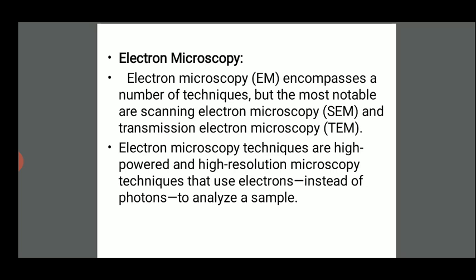These electron microscope methods can be used on all nanomaterial types, and the transmission electron microscopy is specially designed for the nanoscale, as it struggles to provide a high quality image if the sample is more than 500 nanometer thick.